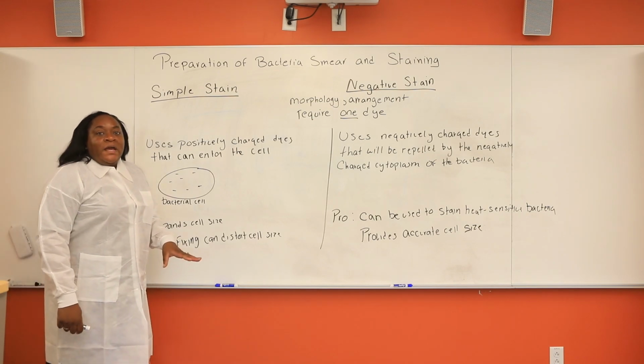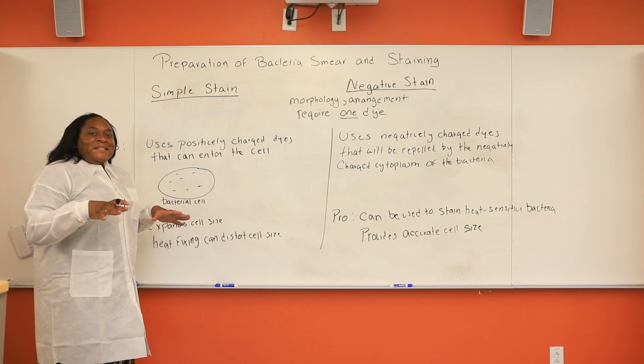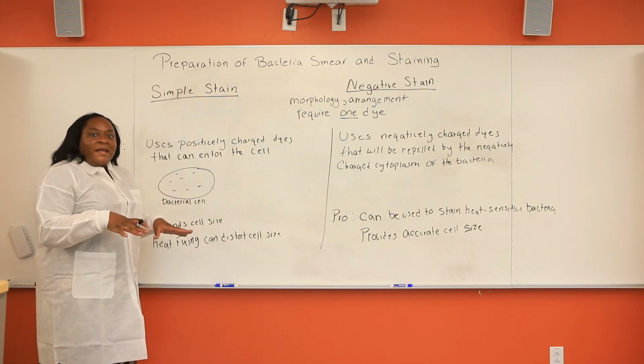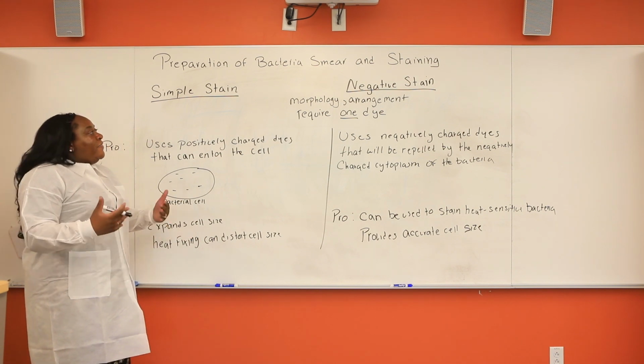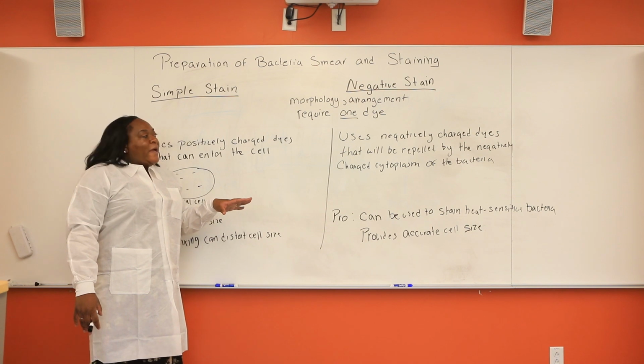Okay, so in this video, I'm gonna go over how to prepare a bacteria smear. A bacteria smear is just a thin film of bacteria that you place on a glass slide, okay? And then I'm gonna walk you through how you can stain that bacteria smear, okay?